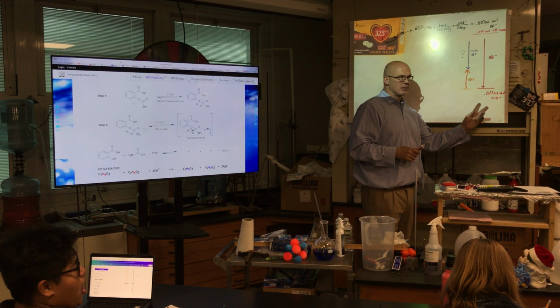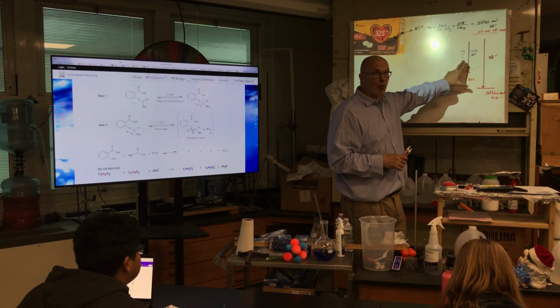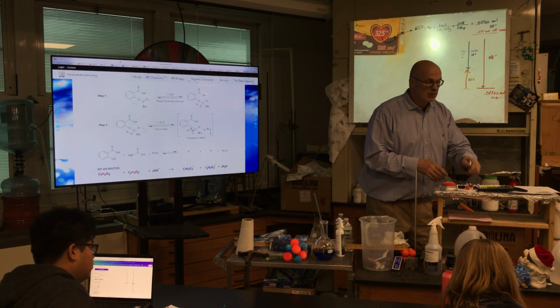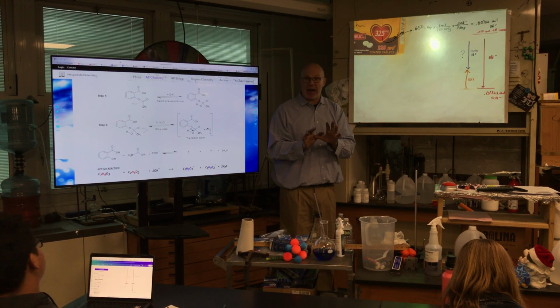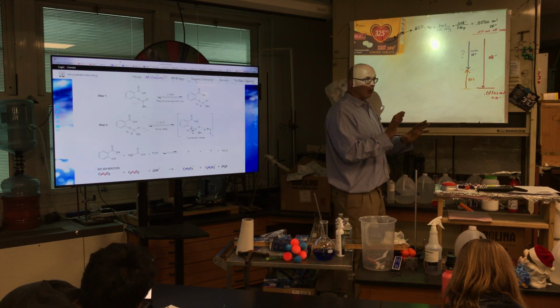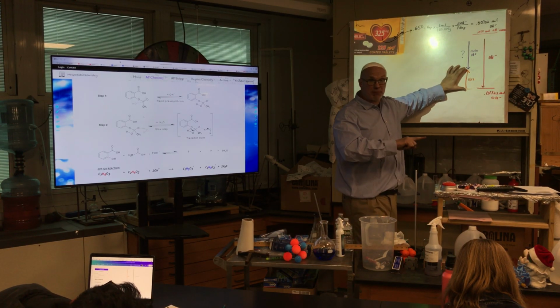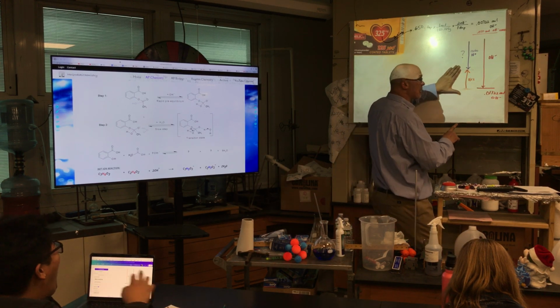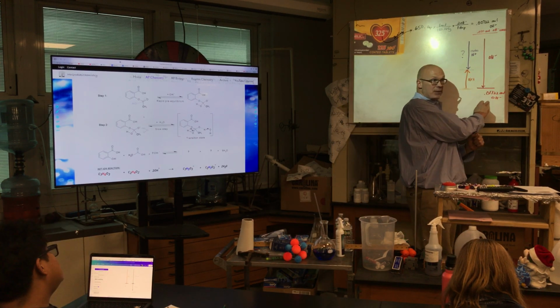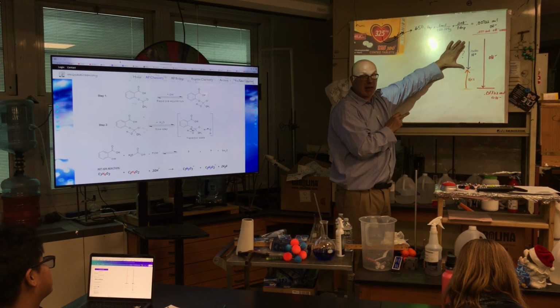Oh, so that's the moles of OH in the aspirin plus extra? Plus the excess. Okay. This is an important number. Stop for a second. To solve for the amount of active ingredient, or aspirin, once I titrate the excess and know the moles of H+, isn't that the moles of hydroxide that's excess? I need to take that amount and subtract it from this amount to get the moles of hydroxide that reacted with the aspirin.